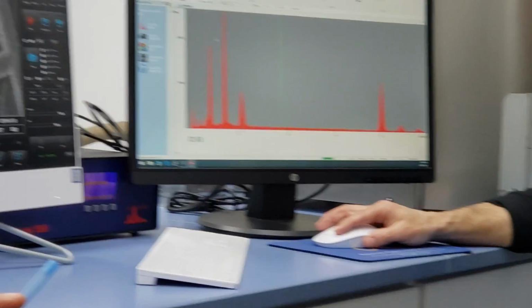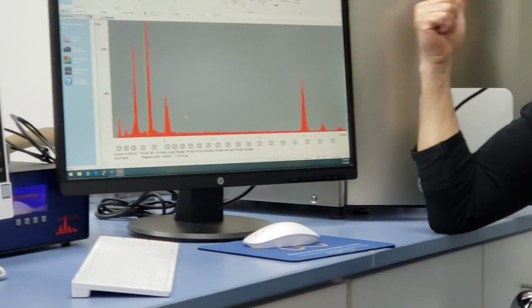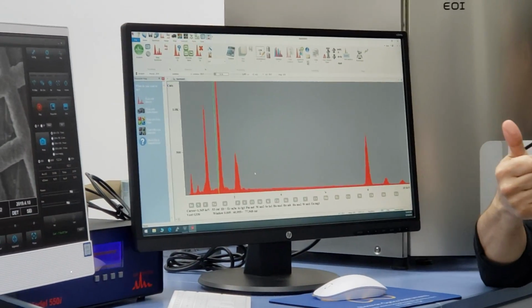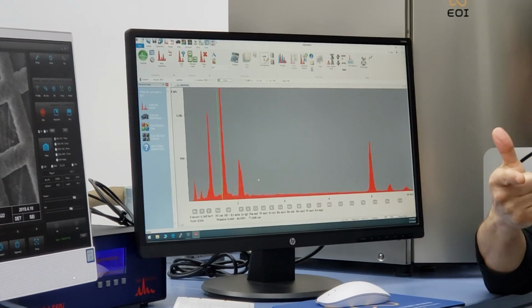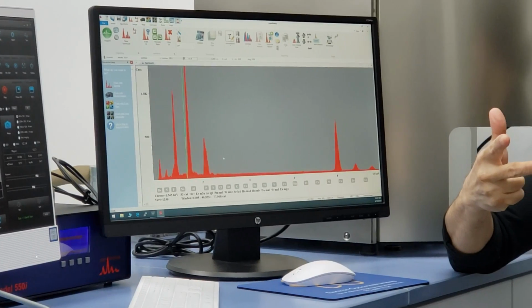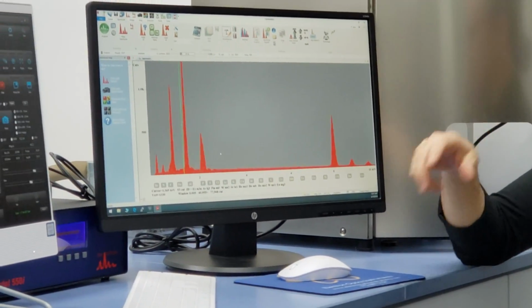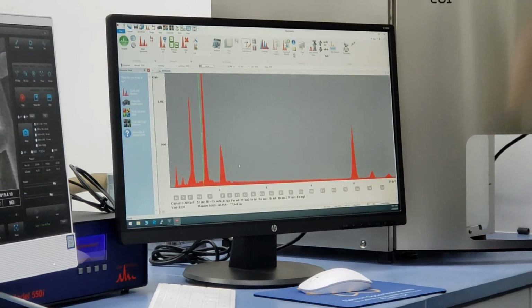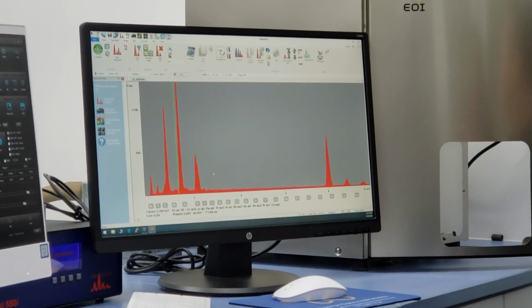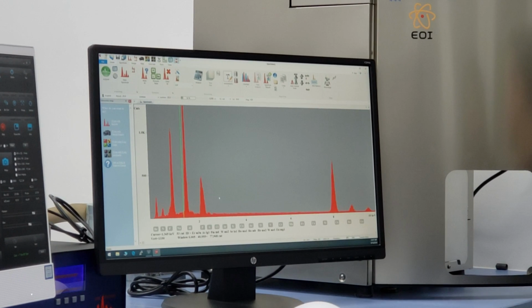Okay, so we talk about advanced stuff, but we can as well. The beam that gets generated from this microscope is secondary electrons, primary electrons, and X-rays. Backscatter or primary electrons. So secondary, backscatter, X-rays. It generates three things. Well, the X-ray detector has a collimator on it, which is a magnet, and it tries to repress the backscatter and the secondary electrons because that's noise.